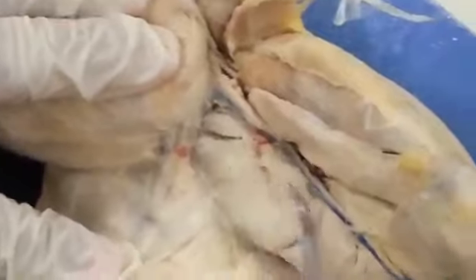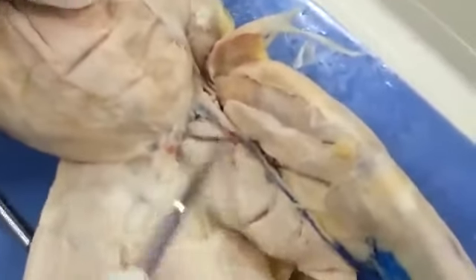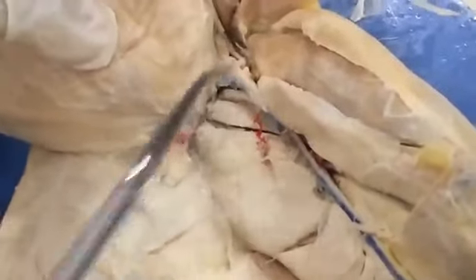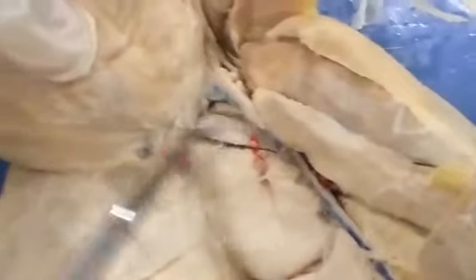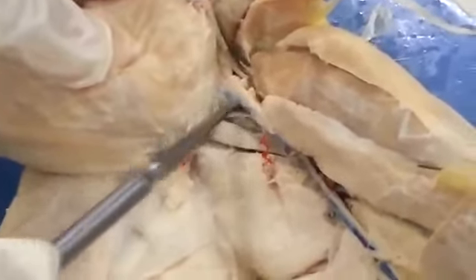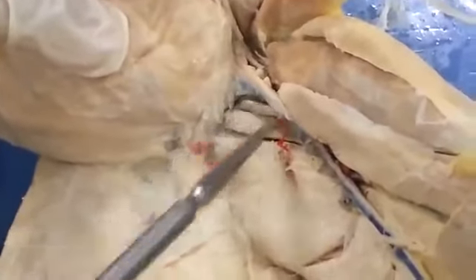And now in the cat, you have the adductor femoris here, which is a large muscle that is not going to be present in humans. In humans, we would have the adductor magnus. The muscles that are also present in humans that are present here will be the adductor longus and the pectineus, slightly deeper. So these would be adductors of the thigh.